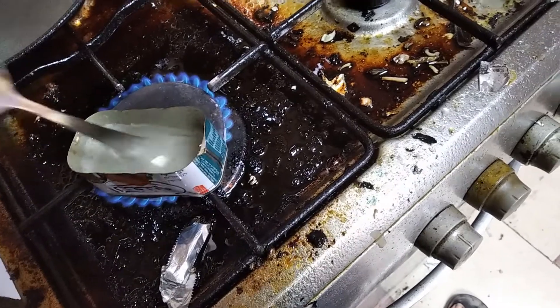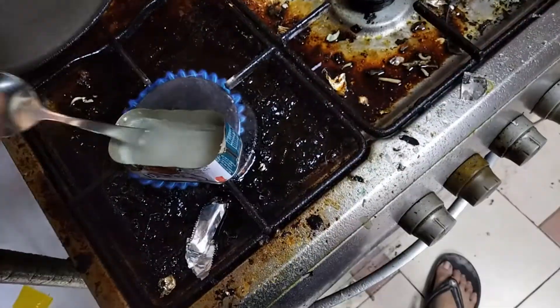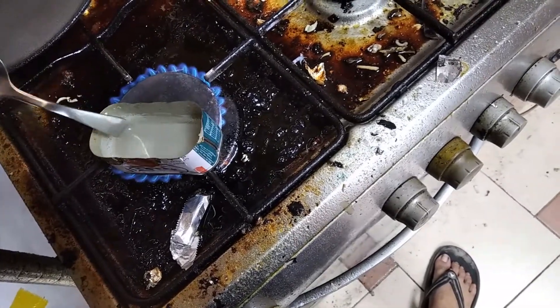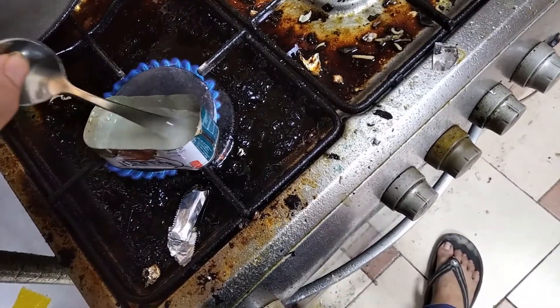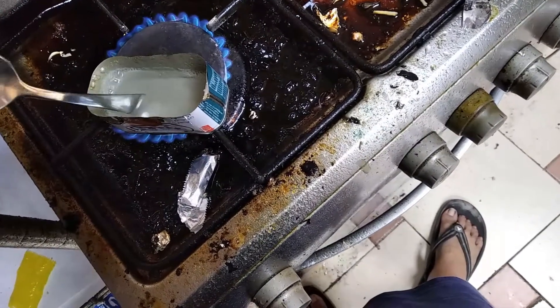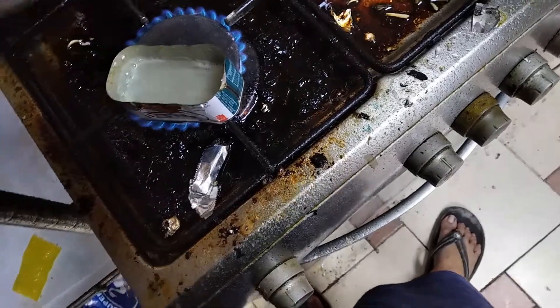You have to keep mixing it so that it does not burn. I think that's it.